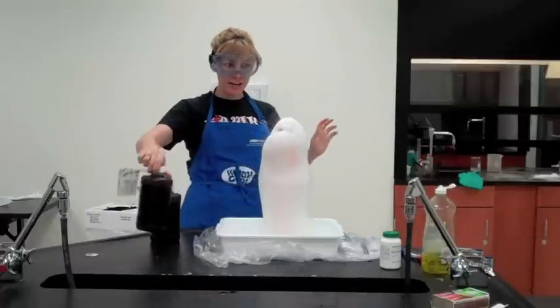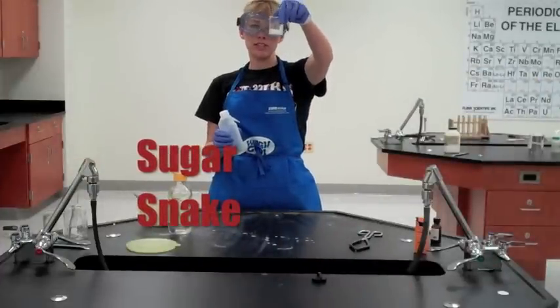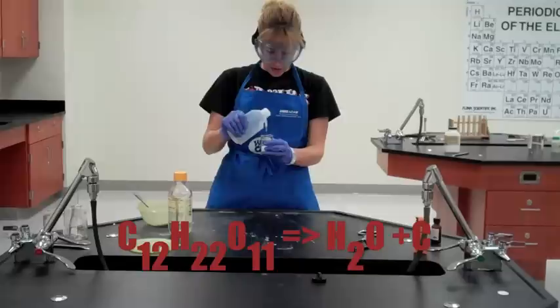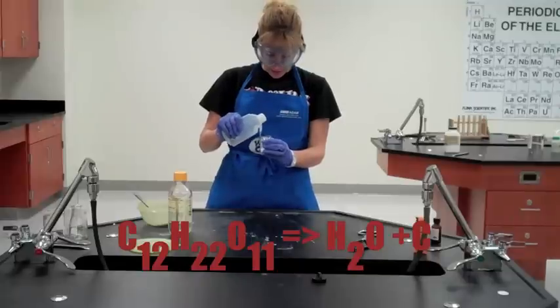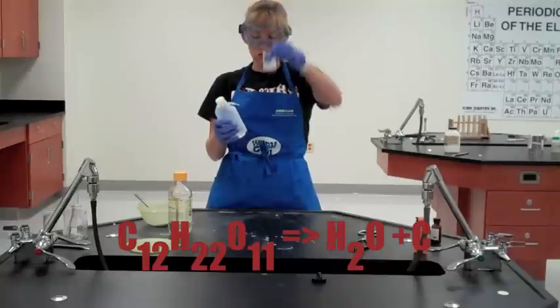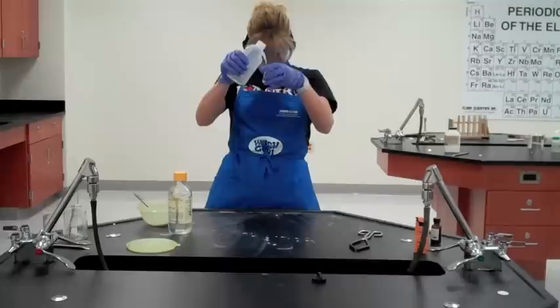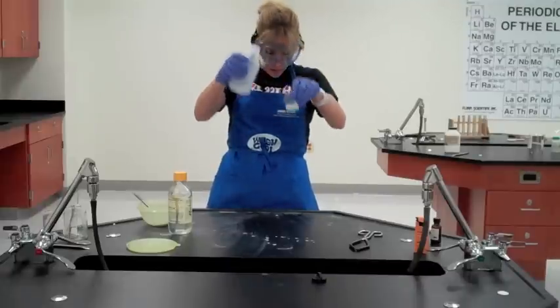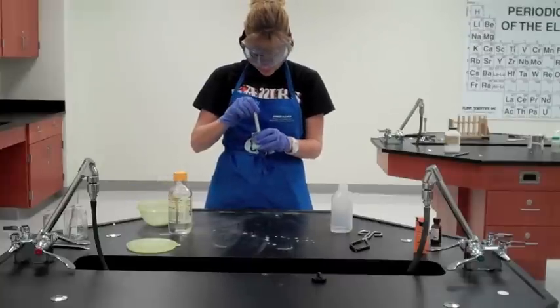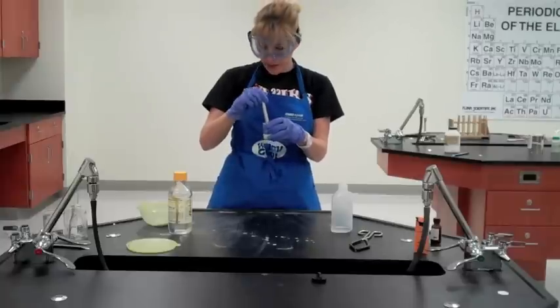This one is called the Sugar Snake. All I have in here is a little beaker full of plain old table sugar. I'm going to add just a little bit of water to it, just to wet it down — not enough to make a true solution, but just enough so all the sugar has been coated with water. Give it a little stir. You almost want to make like a sugar paste.